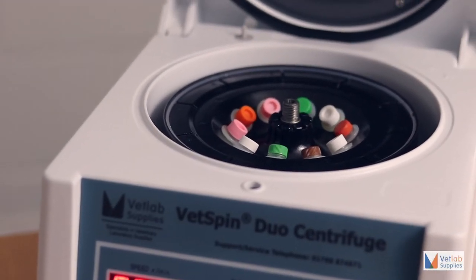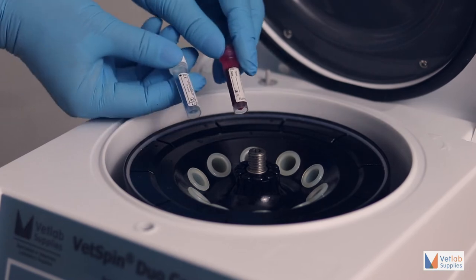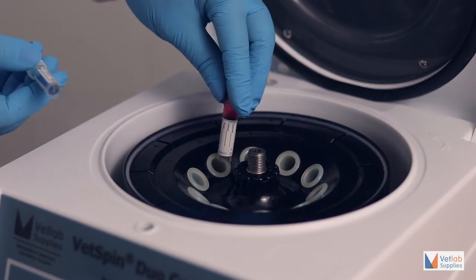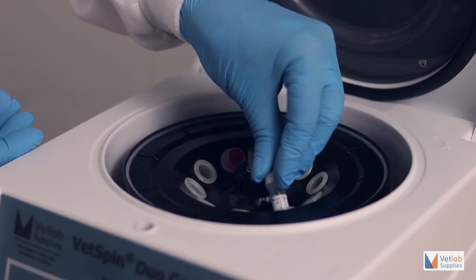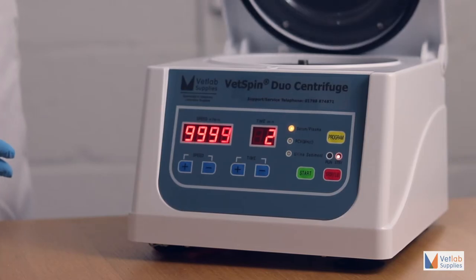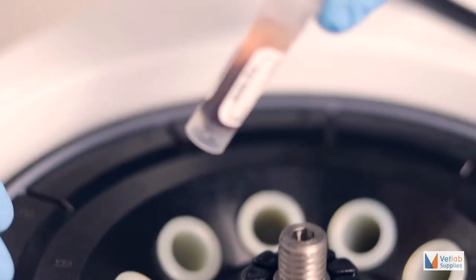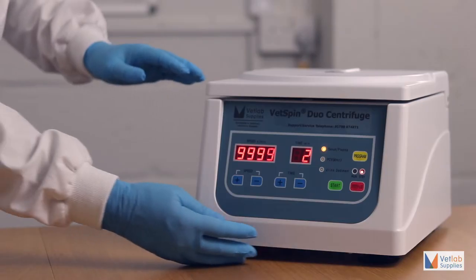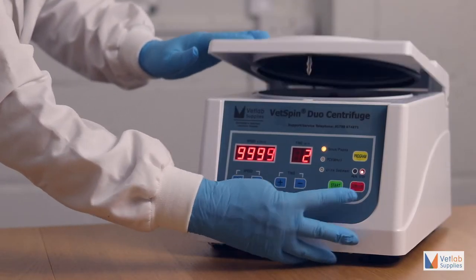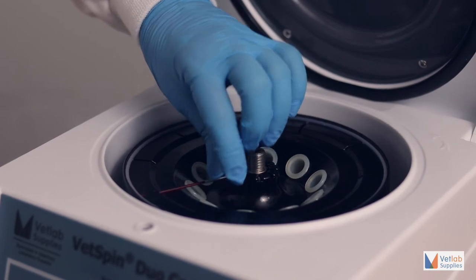The VETLAB VETSPIN DUO has been ergonomically designed for centrifuging biological fluids of up to 2 millilitres in volume and variable speeds up to 10,000 rpm. This multi-combination rotor has been specially designed to hold blood and micro-centrifuge tubes up to 2 millilitres in volume and 75mm micro-hematocrit capillary tubes.